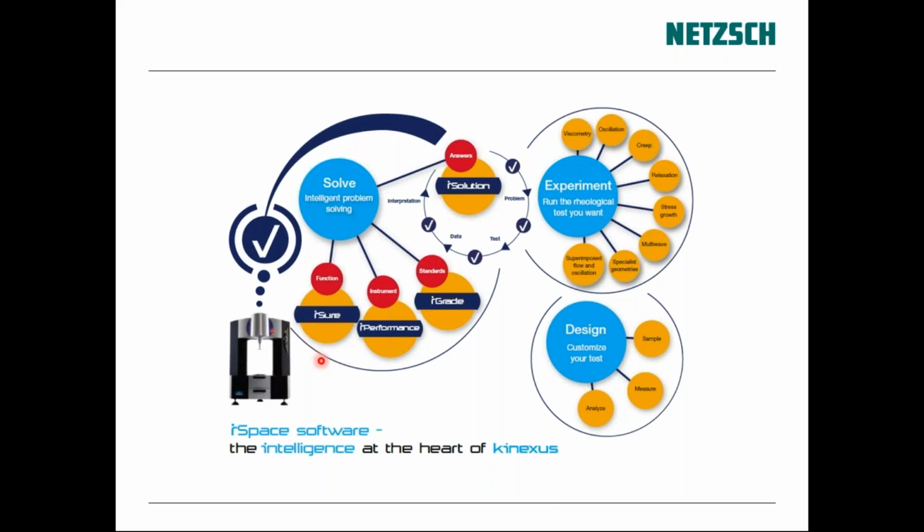So if you were to call the help desk and say, I'm not sure if I damaged my instrument, we were moving it, somebody walked into me or whatever, then the help desk would probably ask you to run sure underscore and then 0002 or 003 or whatever part of the instrument they want to check out. And this instrument sequence will run diagnostic checks on it, and it will tell you if everything's fine, or if it's something trivial, we may be able to just recalibrate it over the internet. Or if it's something major, hardware fault or issue like that, then it should identify which parts will be needed.